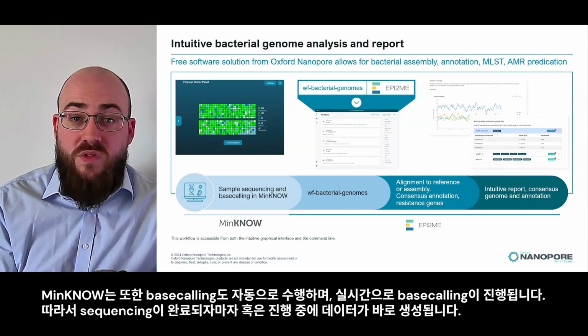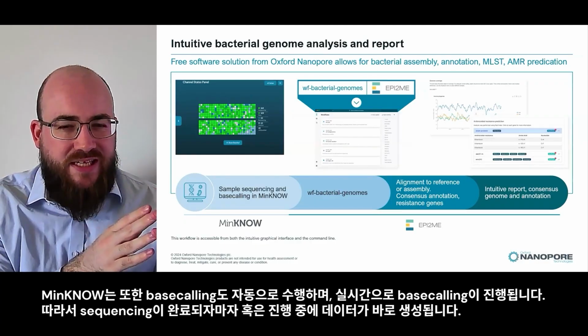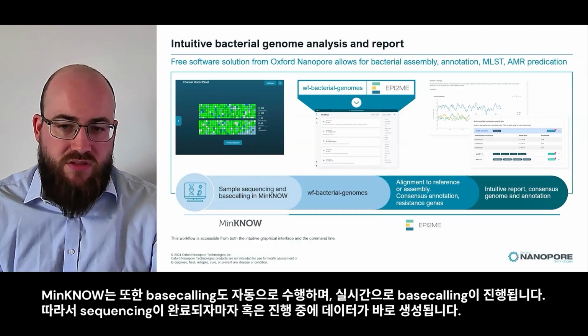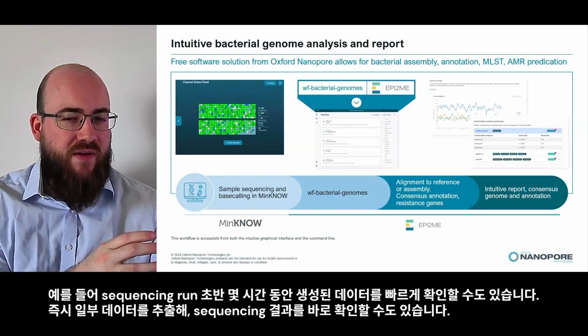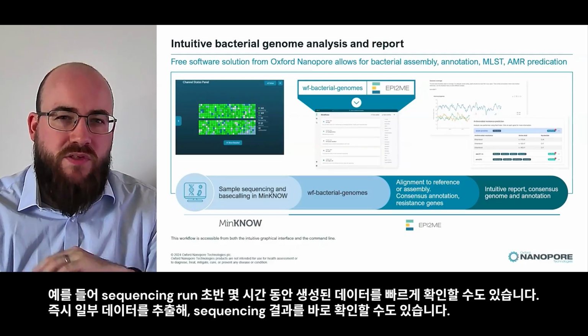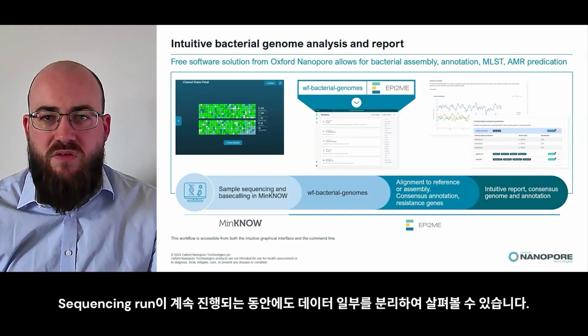Now, that software is also going to do the base calling for you. Again, that's in real time. So that data is going to be ready as soon as the run's finished, or even before. If you want to take, say, a snapshot of the first few hours, you want to get some insights, some sequencing results straight away, we can do that. We can take that off. We can look at it while the rest of the run is still going.